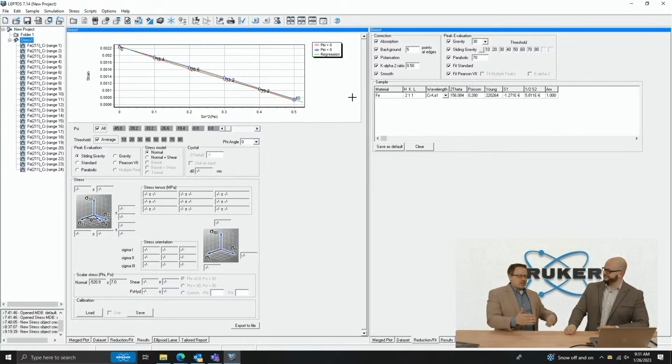So they adjusted those deposition parameters. I think they changed the temperature of the sink while they were depositing, and they were able to reverse the stress and make it compressive. That meant that during that constant cycling, hot, cold, hot, cold, when a microcrack forms, it just pushes it shut. So that's why compressive versus tensile is very, very important. For fatigue, we always look for compressive. Big time.